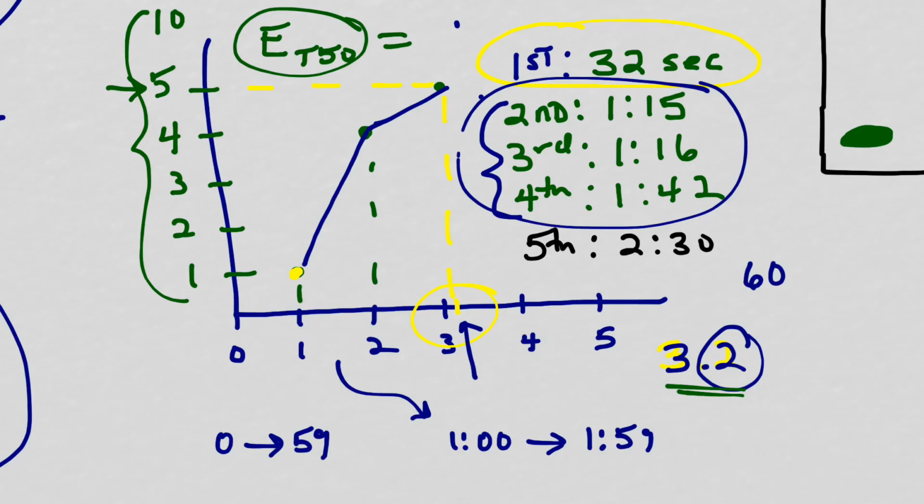And you should make really a bar graph of that compared. So if you did this test with, let's say, red light, and then you did this same study with another group of 10 disks, then you would compare the ET50 of the red light with the ET50 of blue light. And I would like to see a definite graph of the ET50s, which is going to be your median value that represents the time for 50% of your disks to rise. Don't forget that it really represents a rate, since we're measuring time here. All right, so that's how you come up with it.